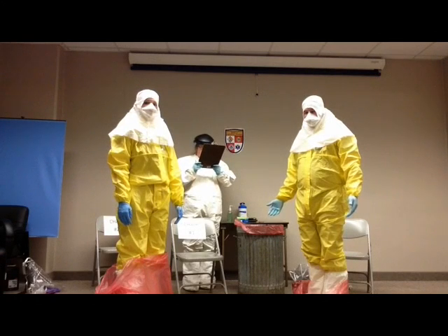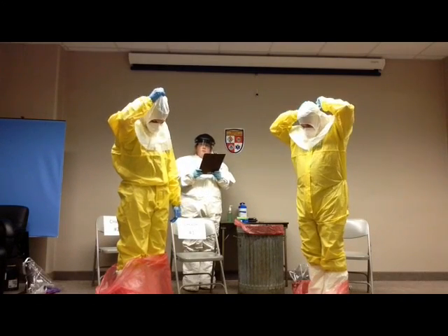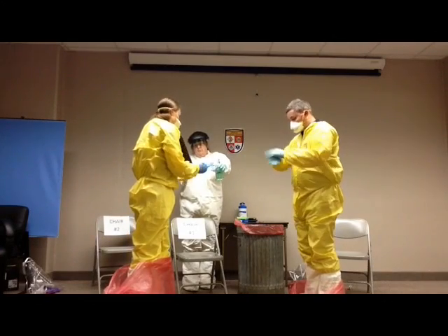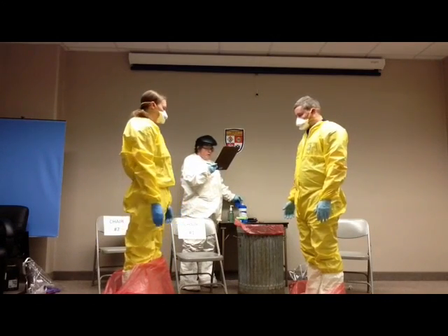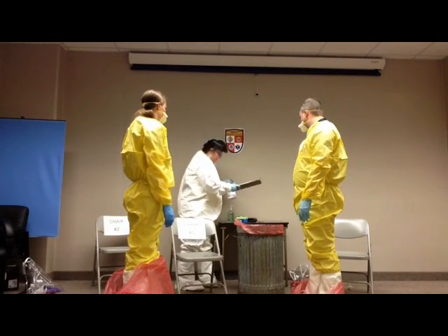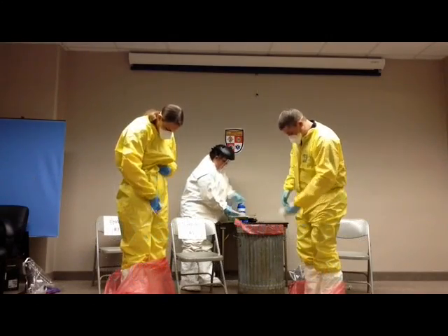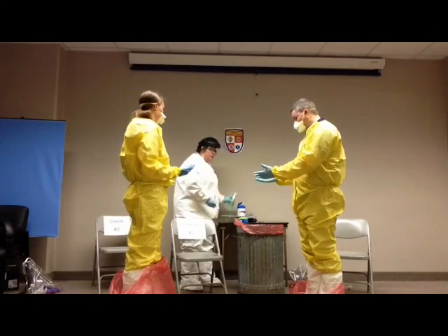Remove surgical hood by untying and tilting head forward. Grab top part of hood, remove, and discard properly. Inspect and disinfect gloves. Disinfect zipper area of coverall from neck down to the bottom of the zipper using an EPA registered disinfectant wipe. Allow for proper contact time for disinfecting. Inspect and disinfect gloves.